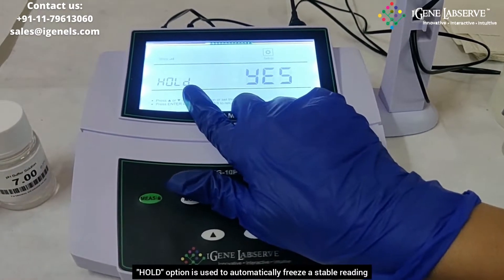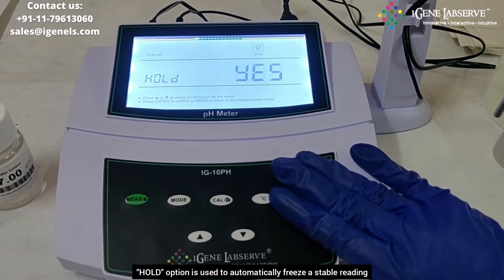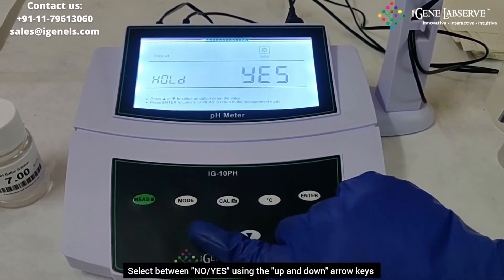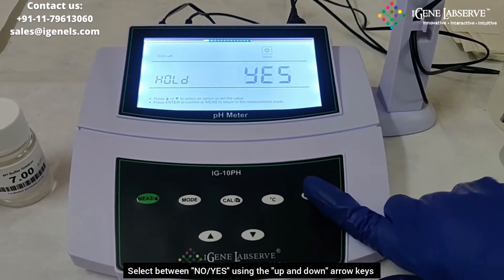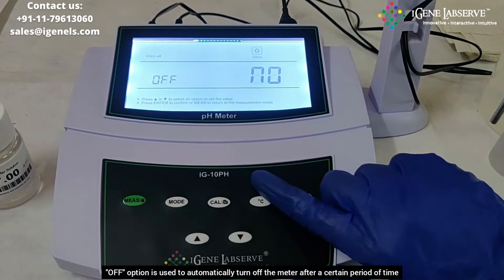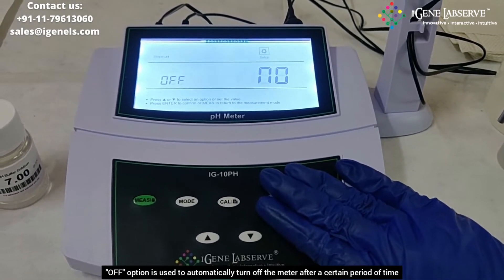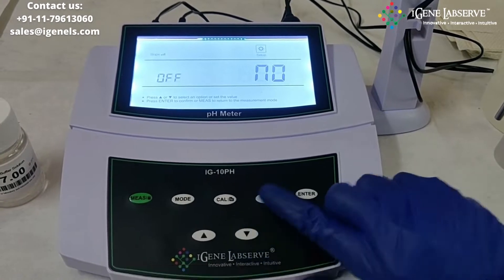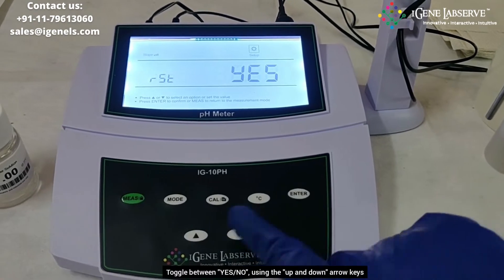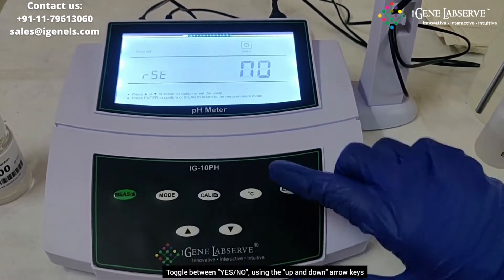It then goes to hold. Hold indicates that the readings will freeze automatically when the machine detects they are stable. You can select no or yes and press enter. It then goes to the auto-off setting, which indicates that the machine will turn off if it is left on for a certain period of time. Press enter and it goes to reset. If you select yes and press enter, it will reset the machine to factory settings.